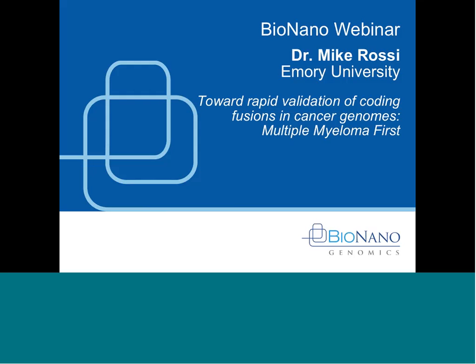We have an excellent presentation today by Mike Rossi from Emory University. And he is going to be talking about some work that he's done in collaboration with us looking at multiple myeloma and using BioNano Genomics Irys technology to do so. Before I hand it over to Mike, however, I'd like to give everybody a little bit of introduction to the technology that Mike is going to be talking about later on. So without further ado, I'll get into a couple of slides.